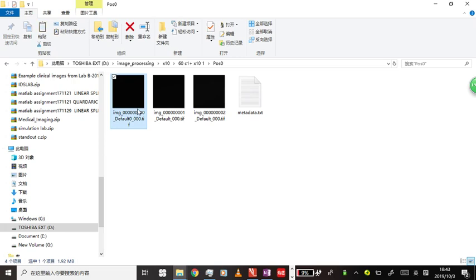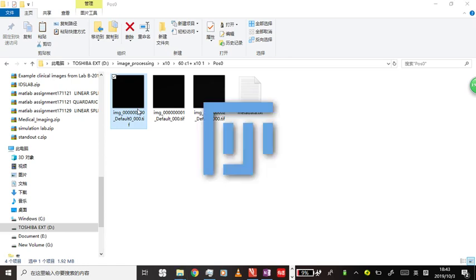Now please note that to fit the images into an ImageJ loop, the images must be taken in order. That is to say, it should always be taken first the green channel, then the red channel, then the blue channel, or first the red, then the green, then the blue. This sequence should be the same for each image inside each folder.